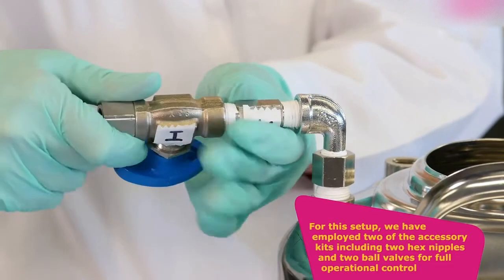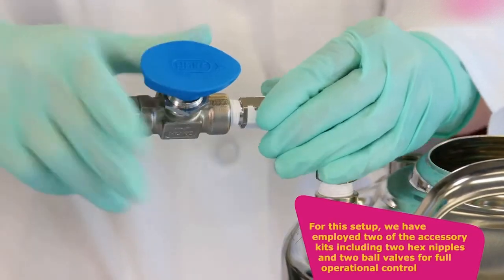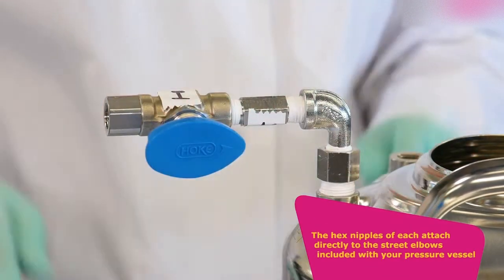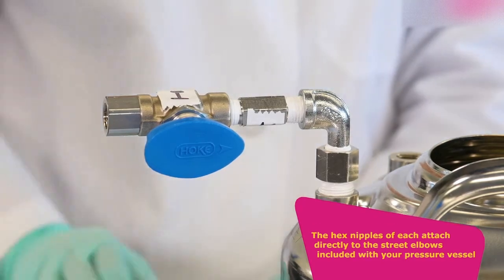For this setup, we have employed two of the accessory kits including two hex nipples and two ball valves for full operational control. The hex nipples of each attach directly to the street elbows, included with your pressure vessel.